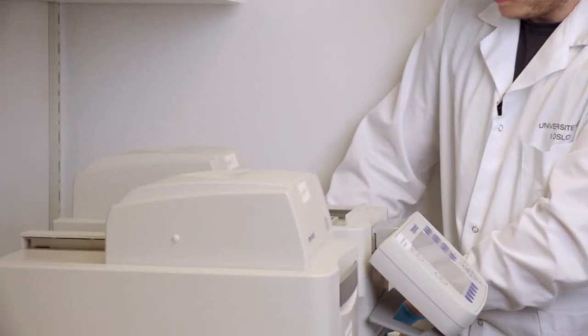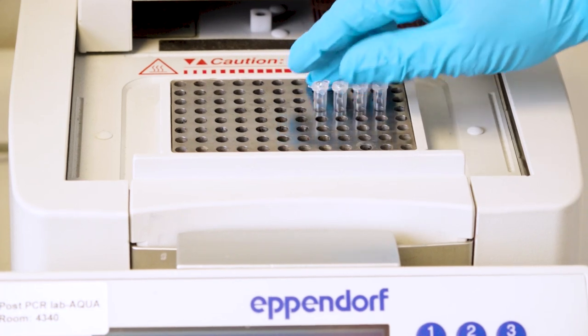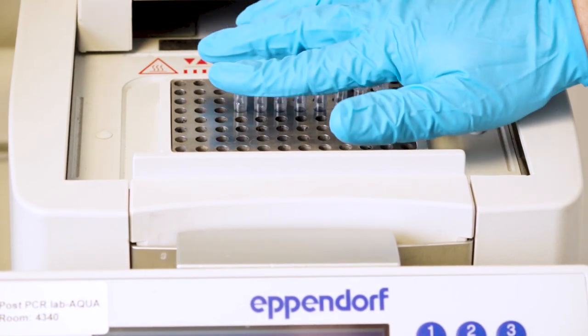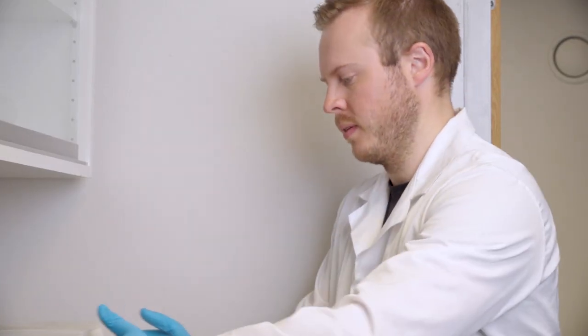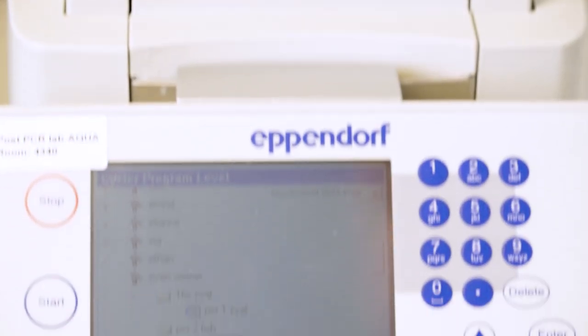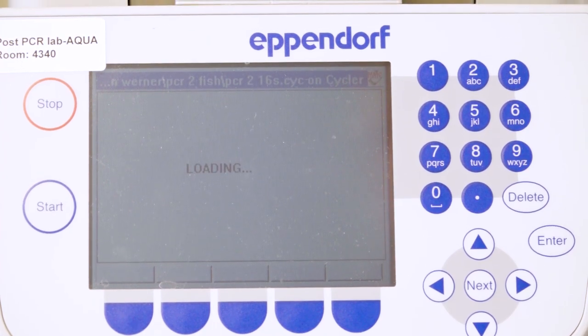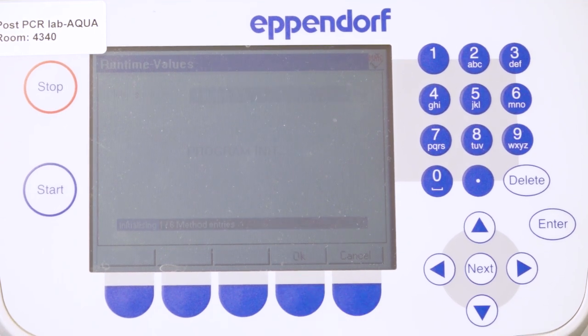Insert the samples into the tubes, close it, and then press the start button. It says loading, then you select OK for selecting tubes.